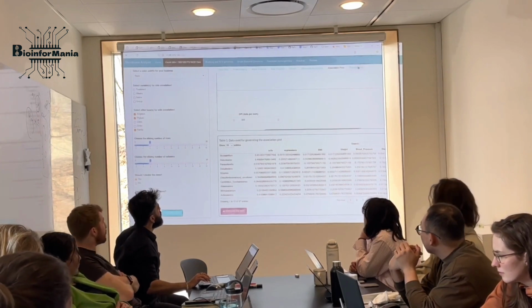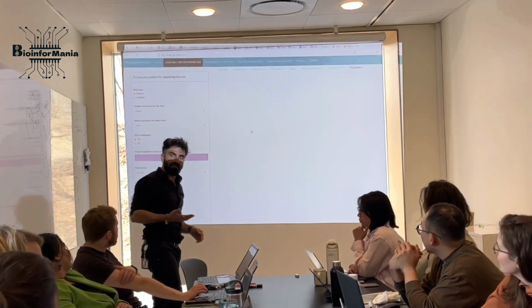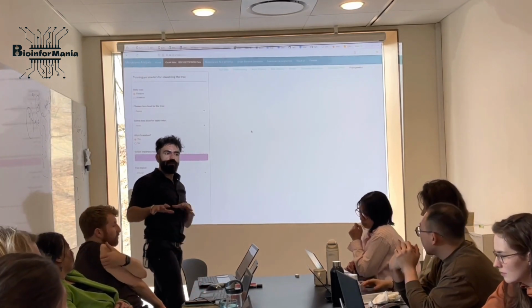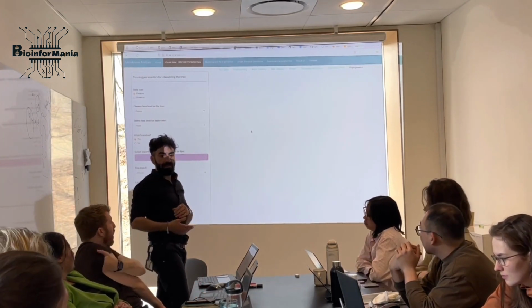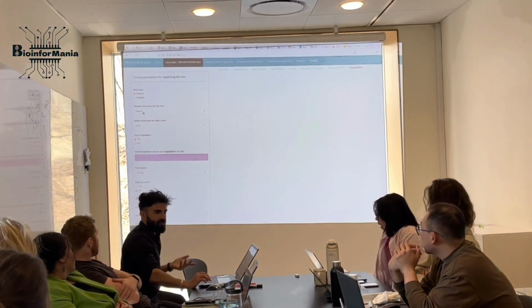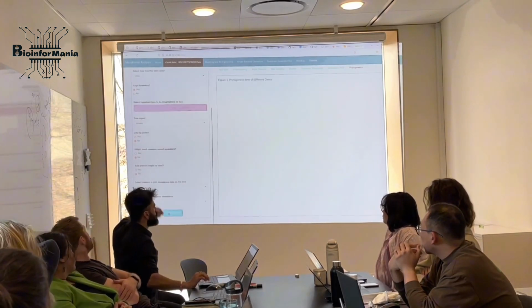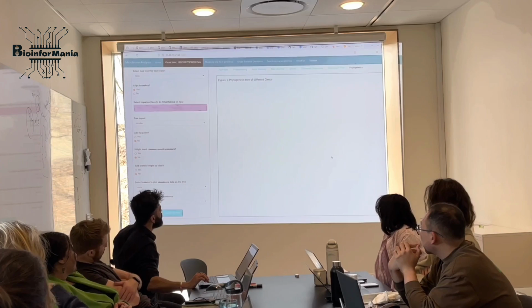That's it. We go to phylogeny. If you have a tree in your data and you want to also see how your variables look with the phylogeny, let's say that I want to visualize the phylogenetic tree at genus level or species, whatever. Let's just do it. See what happens, okay? It should give you a basic tree.